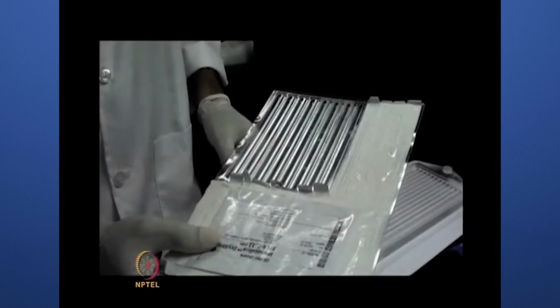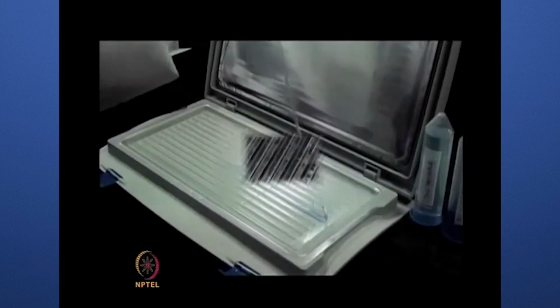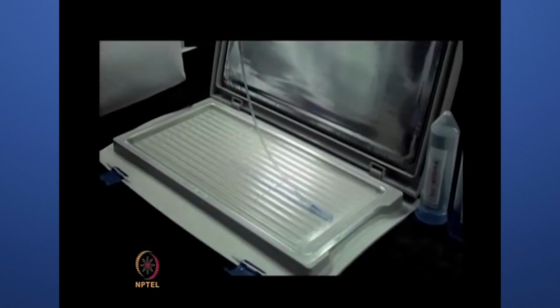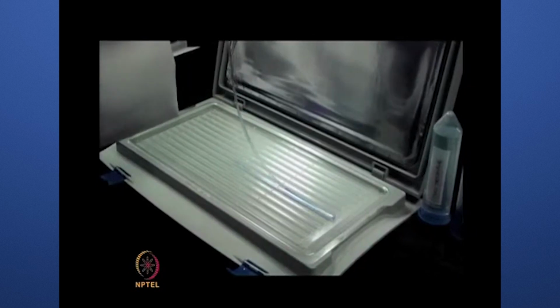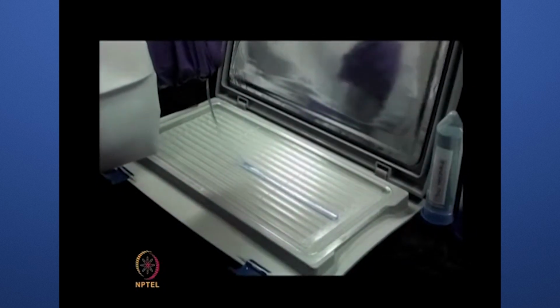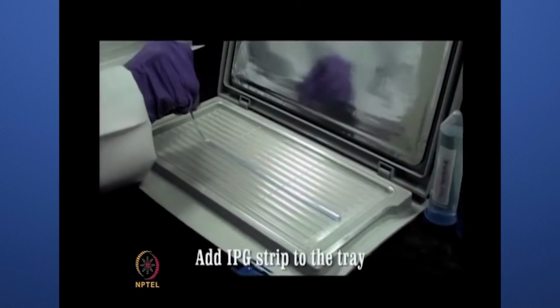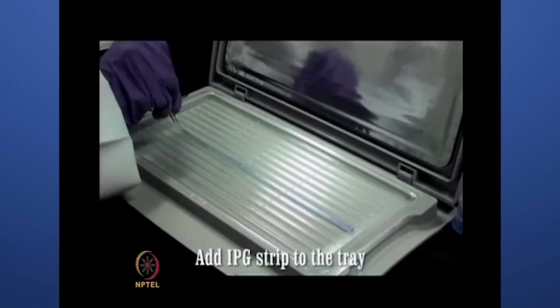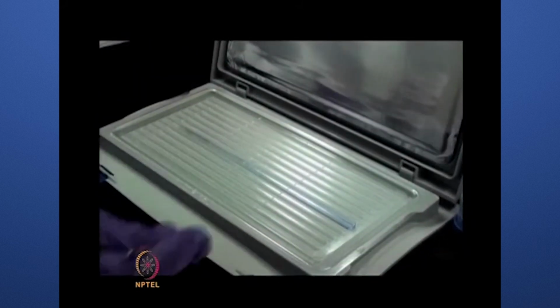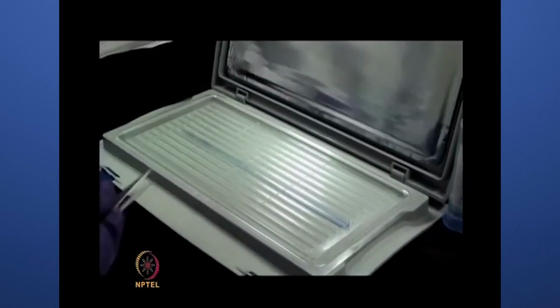Then remove the IPG strip from its cover and place it carefully in the well. IPG strips are used for separation of proteins based on their isoelectric point. These are acrylamide coated plastic strips containing immobilines of various pH spread across it. They have successfully replaced conventional tube gels due to the reproducibility they can achieve.